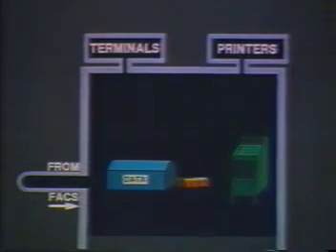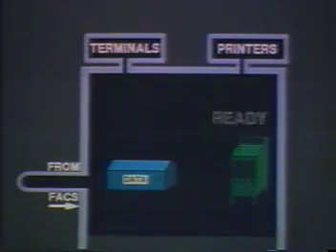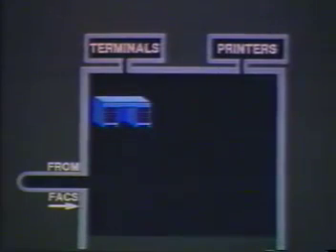When you operate FACS Desk, you don't have to worry about where the data is in the warehouse or understand how the analysis machine works. You won't see direct evidence of either of these facilities on your terminal screen. As far as you're concerned, they're in the sub-basement of the microworld. The only facility that you interact with directly is your FACS Desk itself. As a FACS Desk user, you'll receive a private desk with drawers that help you to run your experiments and keep track of your data.